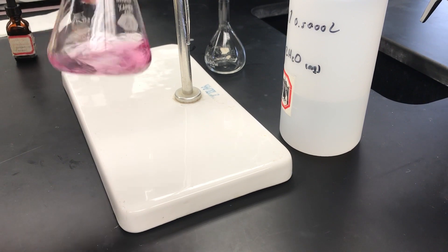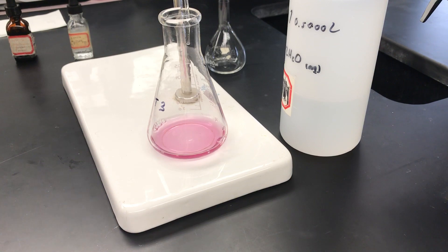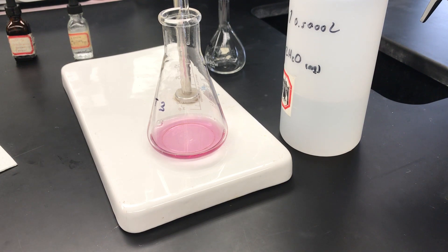Now I need to get an initial volume on this burette. I have a paper towel here and I can read it. It looks like I'm right at 0.00 on the burette. So now we're going to begin the titration.